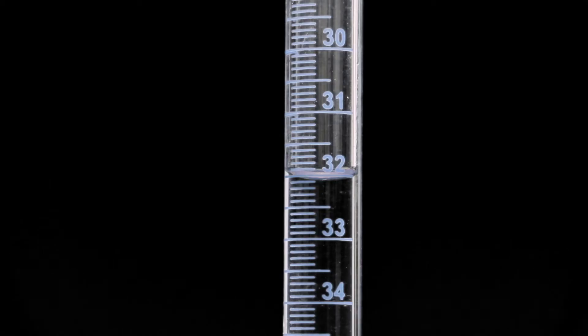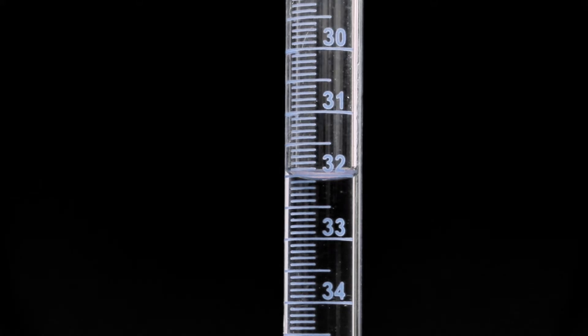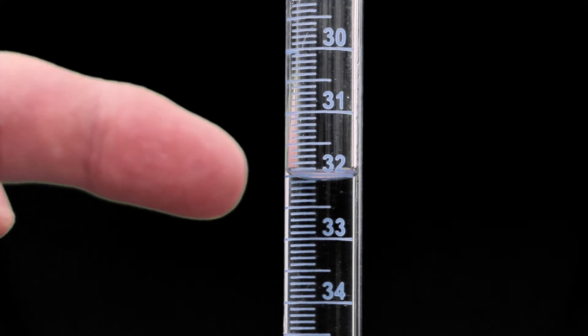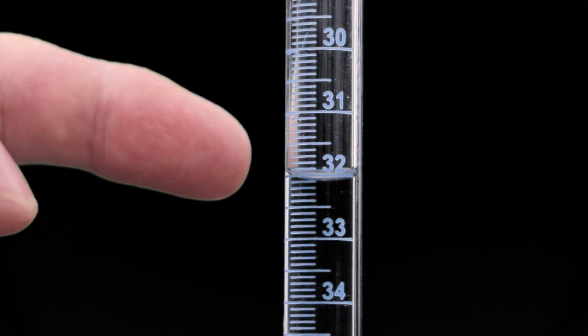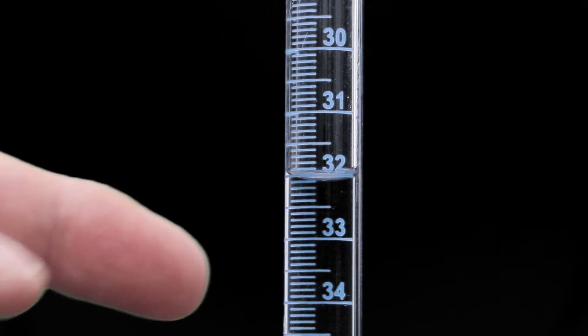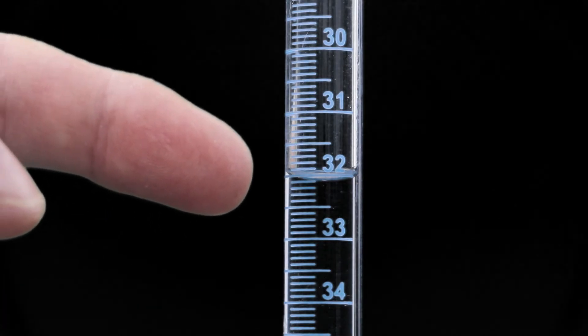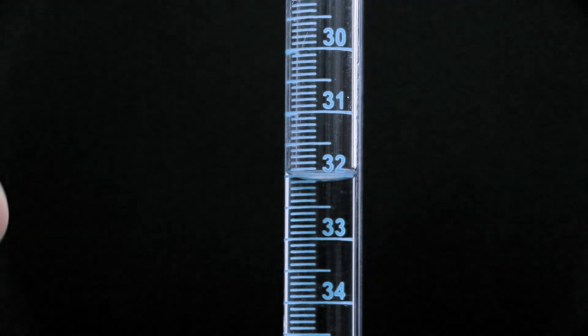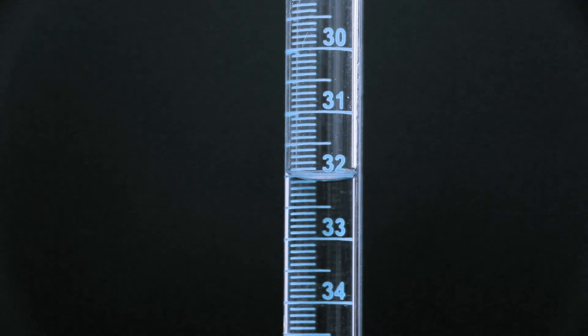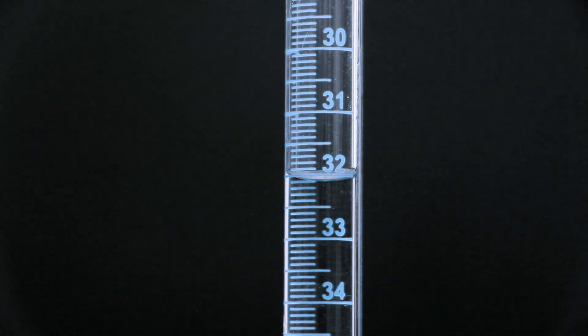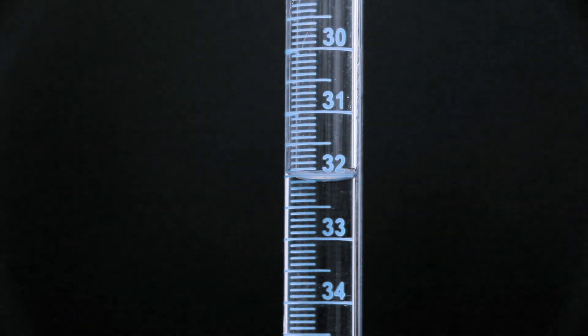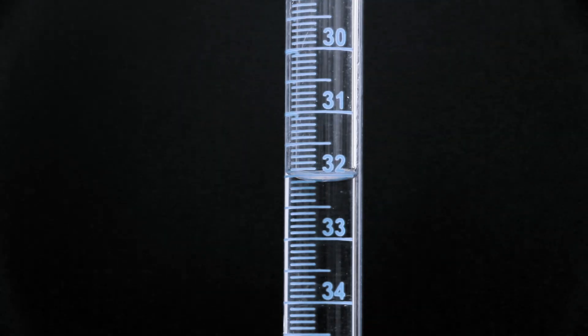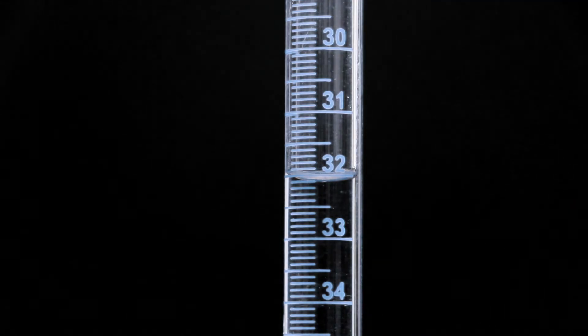Now that we've filled up the burette we need to take a reading. We look very carefully at the burette and we can see an upper meniscus and a lower meniscus, or perhaps some people take an average. Probably easiest just to measure the bottom of the meniscus. The bottom of the meniscus here is pointing to 32, so we'll take that as our first reading and then we'll do the titration.